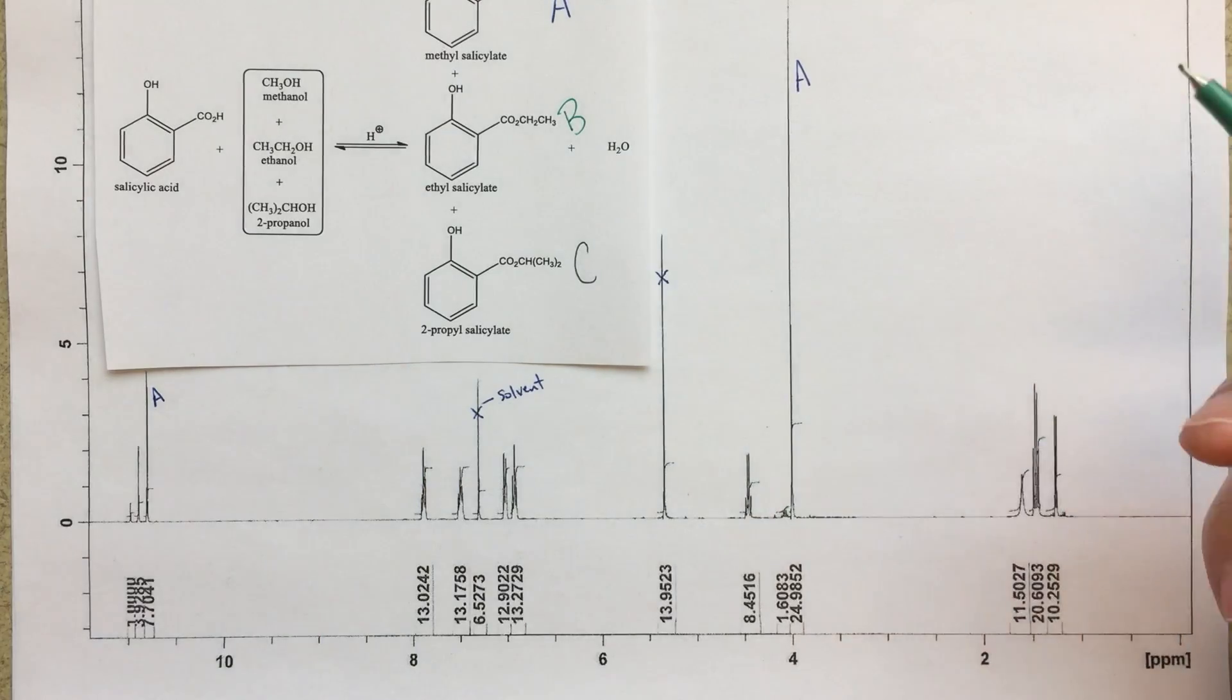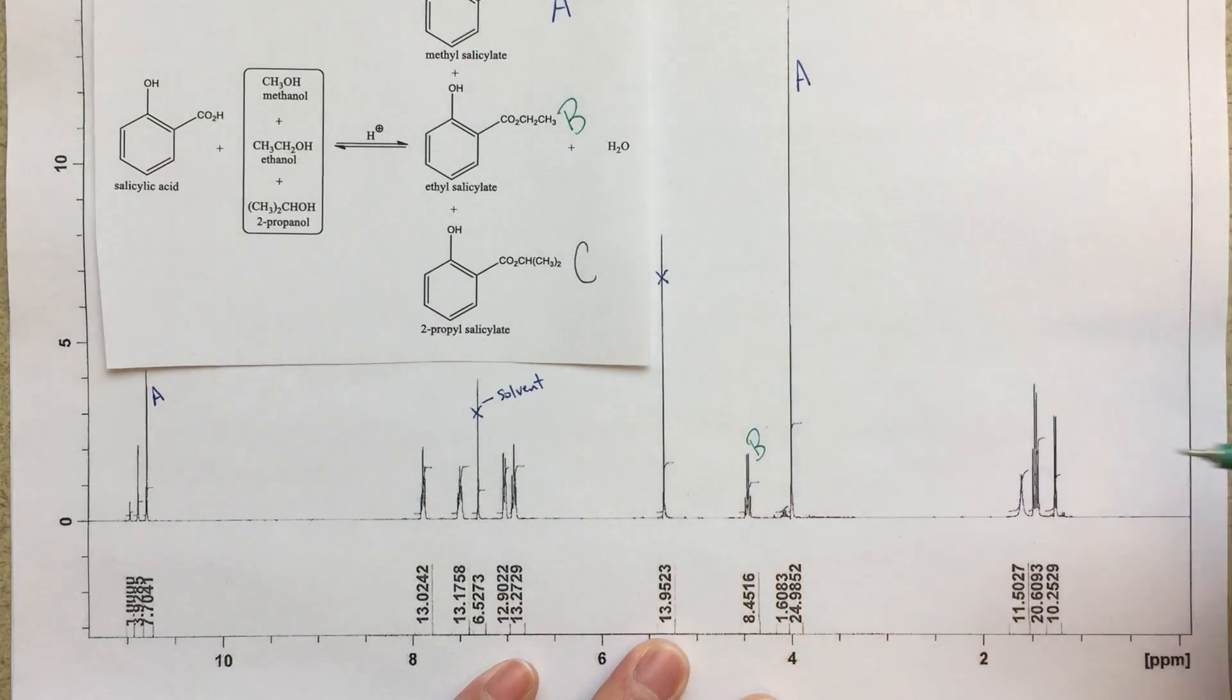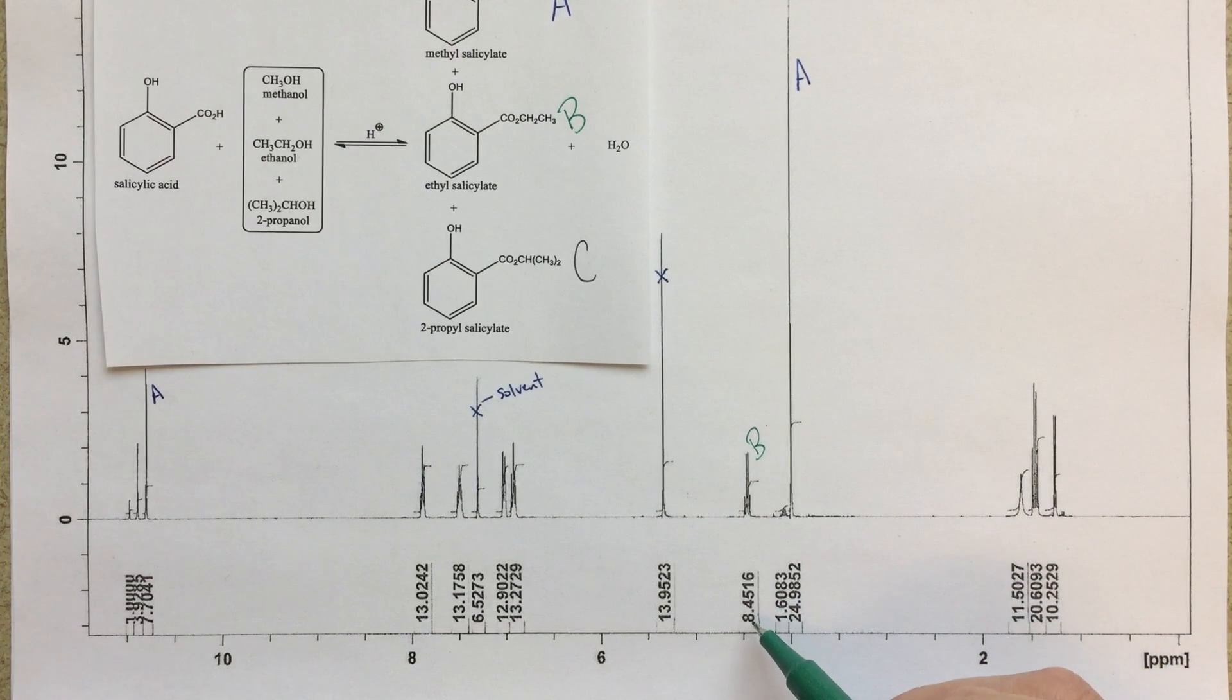So you sort of see that common motif, you've got a quartet over here, and then you've got a triplet over here, and it would integrate to two to three. So very clearly, I see a quartet here. That we can assign to B, and I've got this integration of 8.4516. Now I've got three choices over here, and this peak here, the one most upfield, to me this looks like a doublet. So it does not look like a triplet, it looks more like a doublet. So it's probably not that peak.